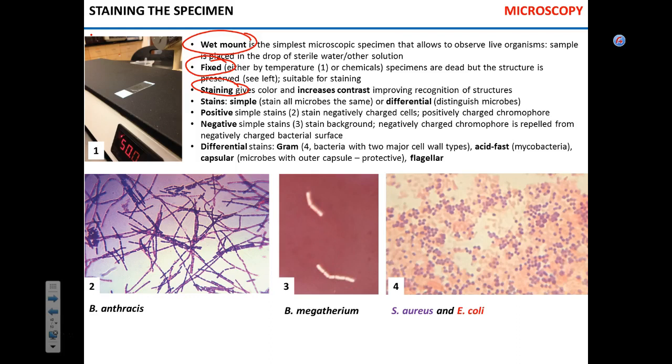So on the left here, illustration 1, you see somebody not lazy fixing a specimen on the heat pad. We're going to use a much simpler and faster method. We're going to be using Bunsen burners. You prepare a wet mount without a cover slip and run this wet mount through the Bunsen burner 3 times. 1, 2, 3. Specimen is fixed.